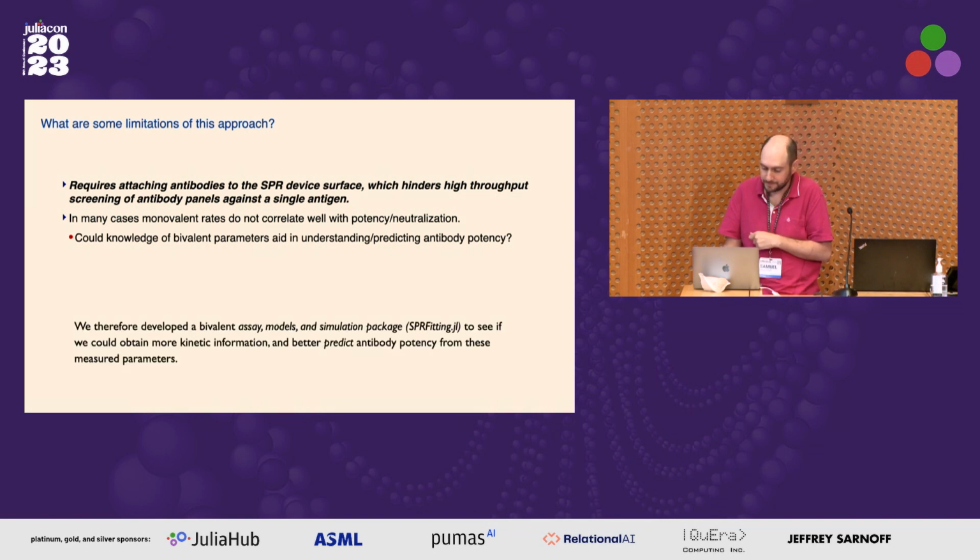So it doesn't help you in all cases with trying to predict how well an antibody can neutralize an antigen. So this was kind of the motivation for developing a new model that's maybe a more detailed physical model of the process, a new assay approach, which has been used in other contexts but is new when coupled to this model, and then a simulation package to kind of let you do the parameter estimation, which is what I'm going to tell you about today.